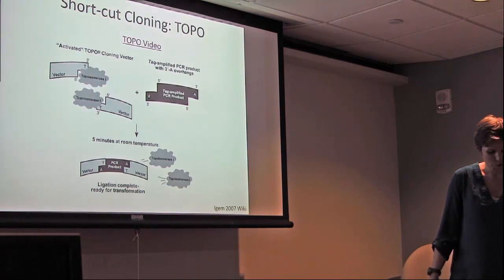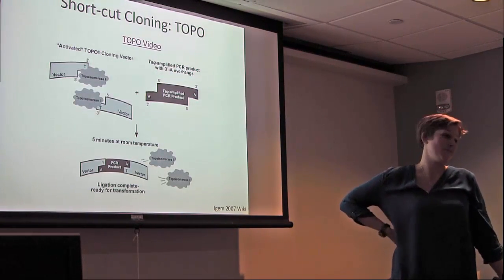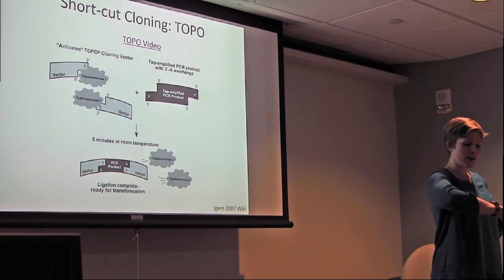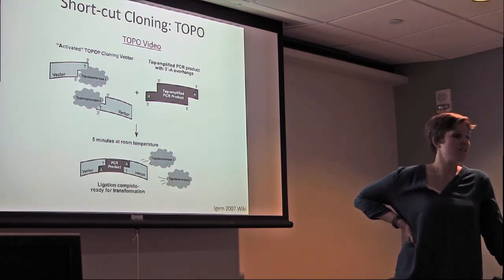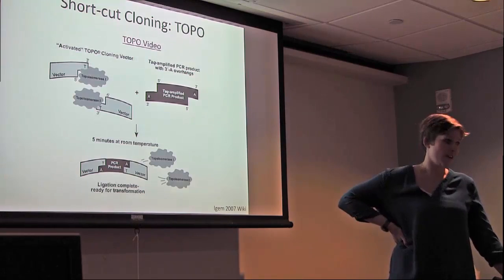So I've told you the difficult portions of cloning. This is how it was done a while back, and before that it was even worse because there wasn't Vector NTI. But there are some new tricks that are really, really helpful with cloning, and they just involve going to Invitrogen, for example, and just ordering a full topo cloning kit.